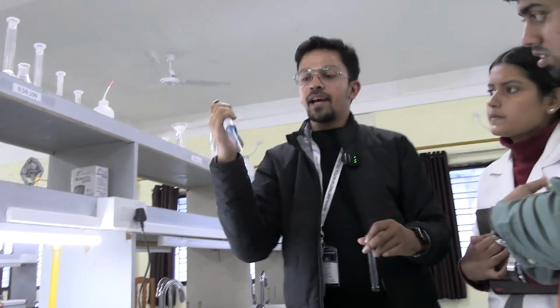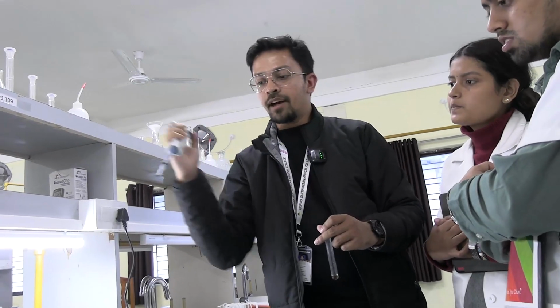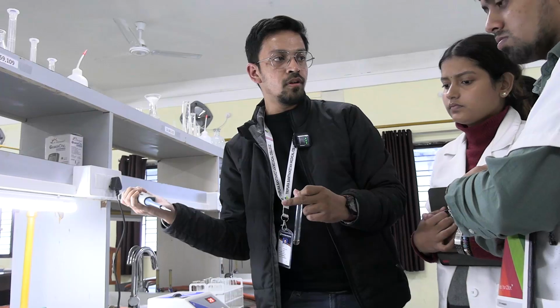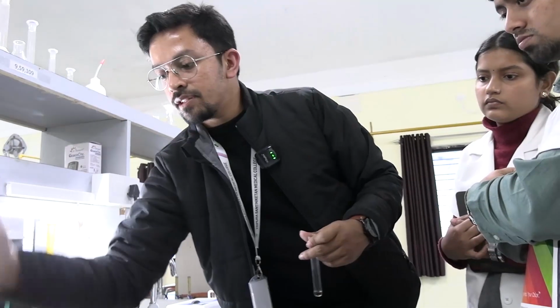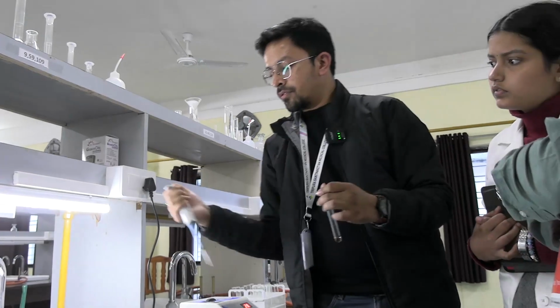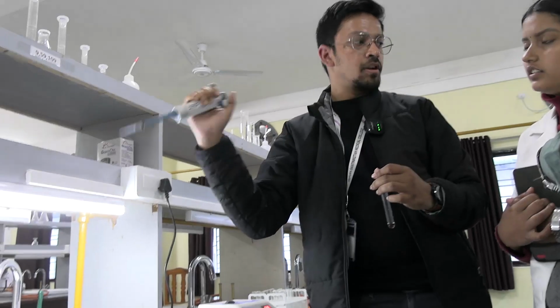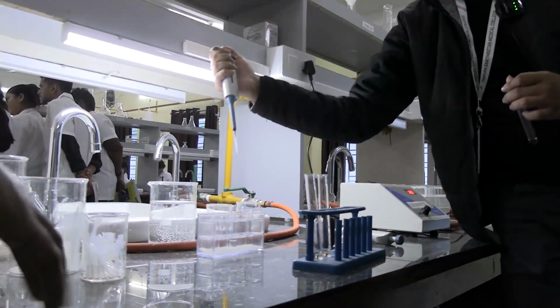Now after my standard, I have to change this tip, because right now I will be taking samples from the unknown sample. If it contains less, it gets mixed with the standard, it can give you a false result. Release it, take a fresh tip, and I will take from the sample. How do you release it? Over here. If you press it, it will get released.